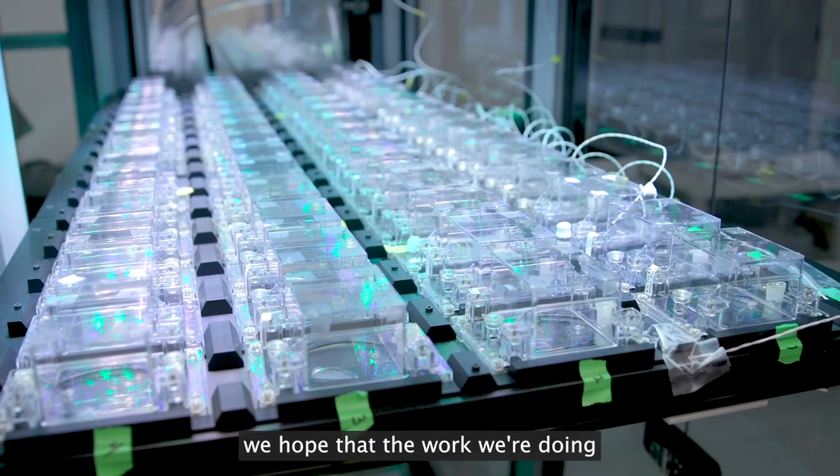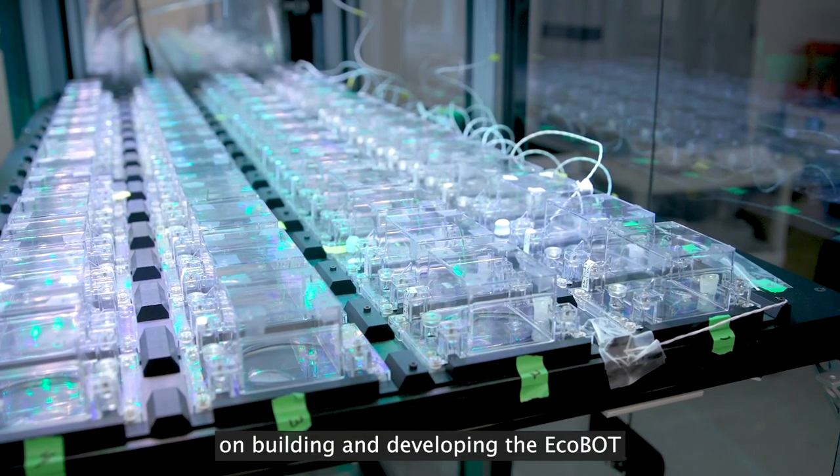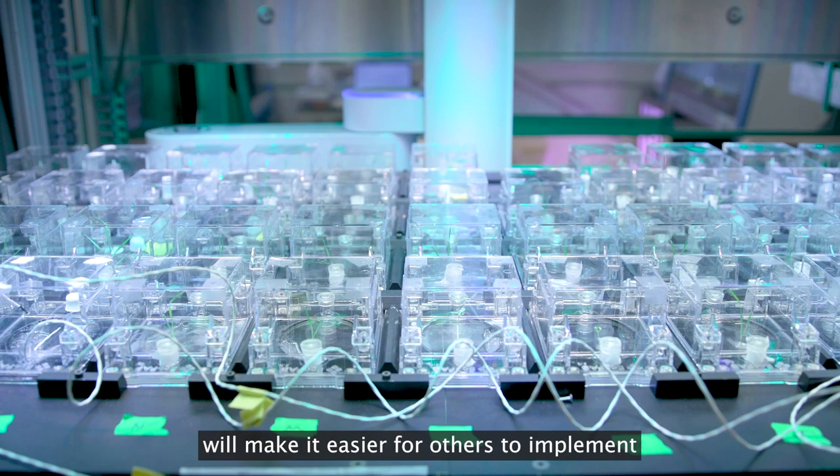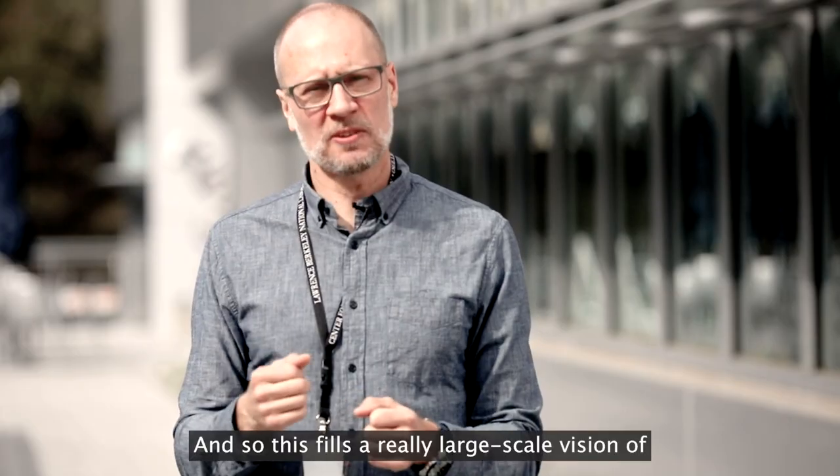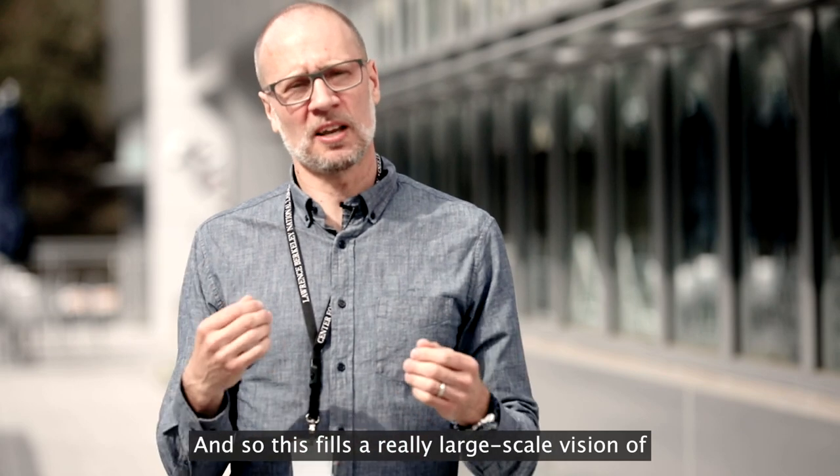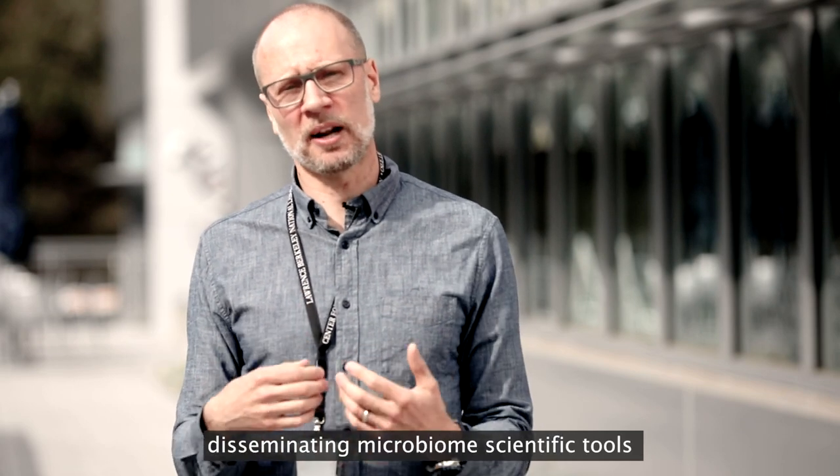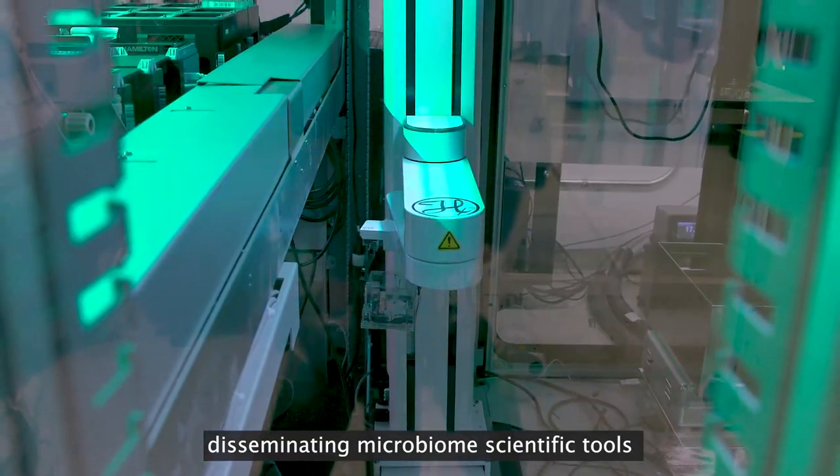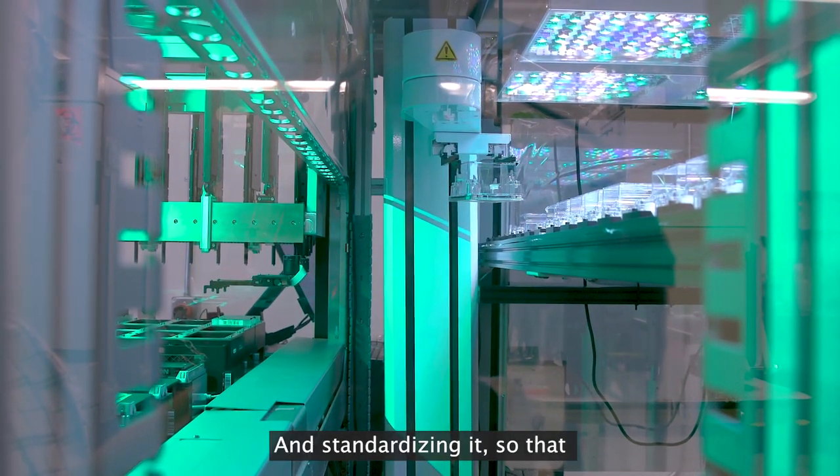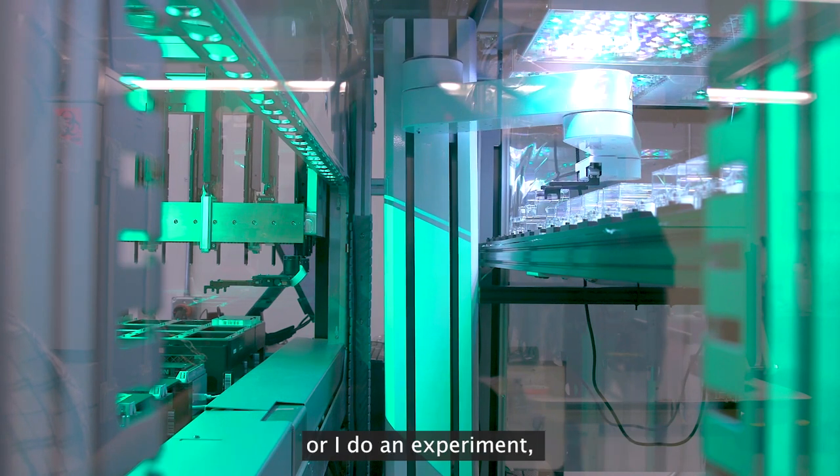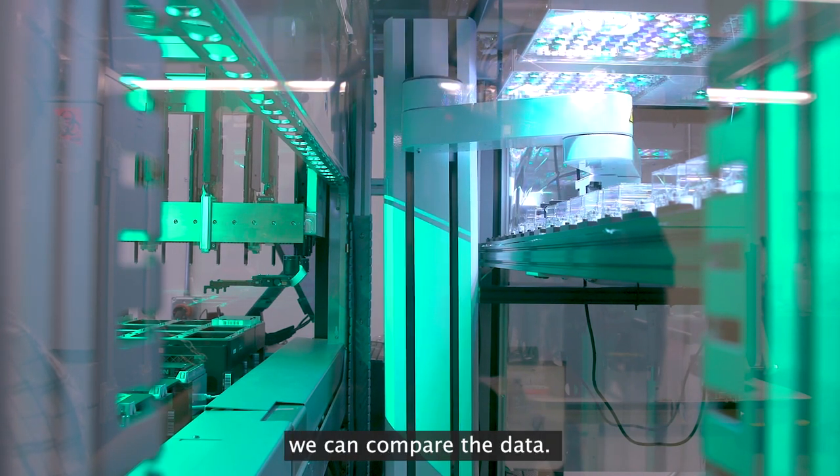In the long run, we hope that the work we're doing on building and developing the ECOBOT will make it easier for others to implement that same sort of work and build their own ECOBOTs in their own labs. This fills a large-scale vision of disseminating microbiome scientific tools to the larger scientific community and standardizing it so that it doesn't matter whether you do an experiment or I do an experiment, we can compare the data.